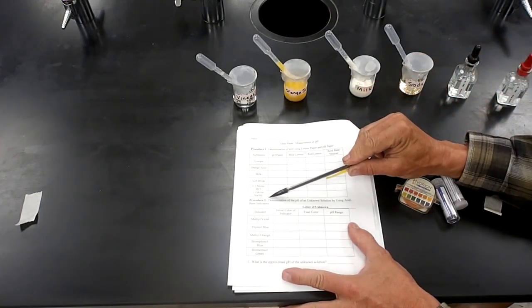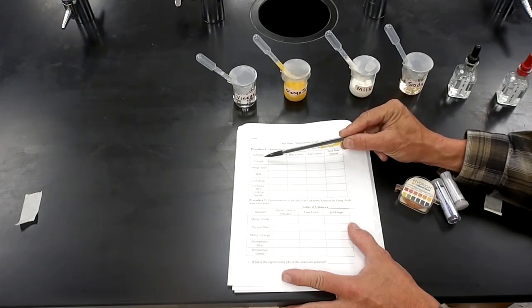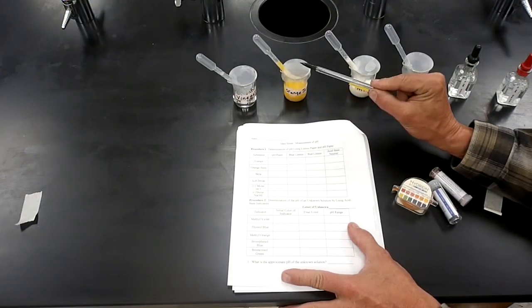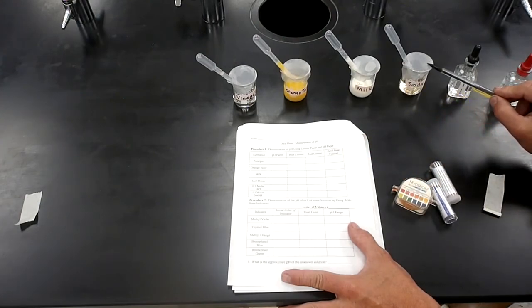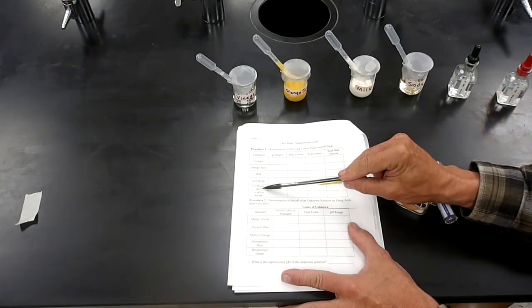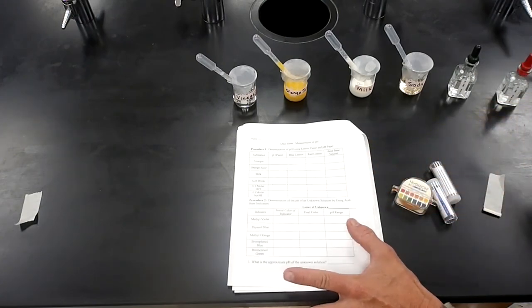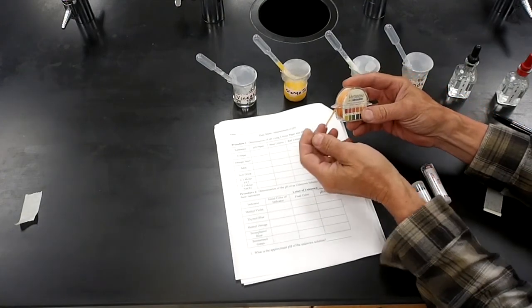So this will be procedure 1. We'll work on this one first. What you've got here on the left-hand side is the substance. We've got vinegar, orange juice, milk, some kind of soft drink, looks like Sprite or something, 0.1 molar hydrochloric acid, 0.1 molar sodium hydroxide. This is pH paper.